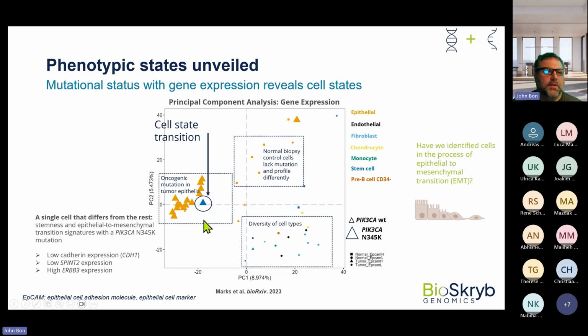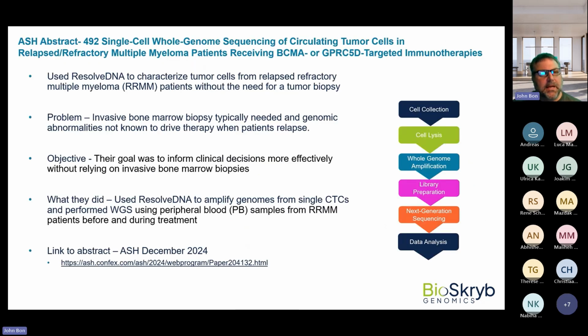This is the type of work that can be done when from the same single cell you get the DNA amplified as well as the full-length transcriptome. I have a couple more slides.